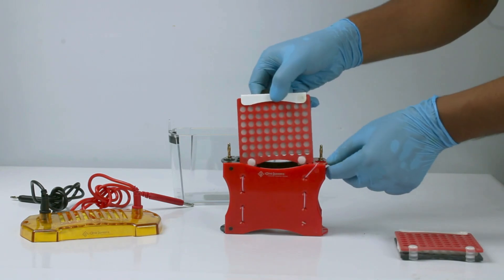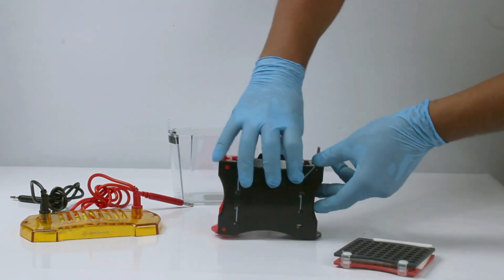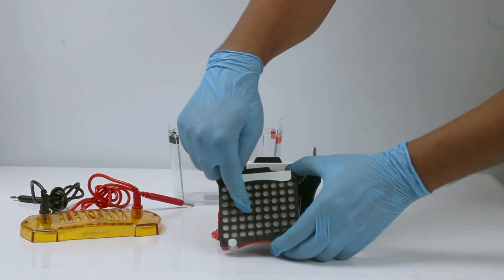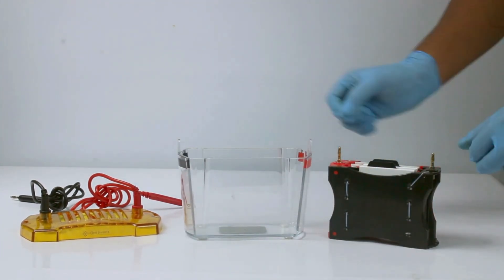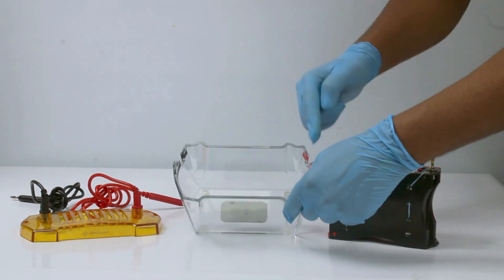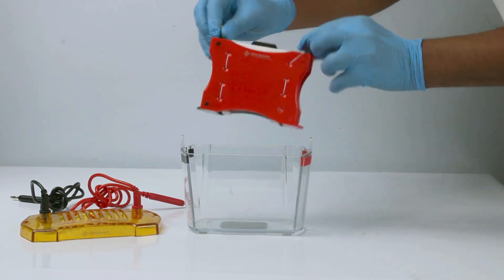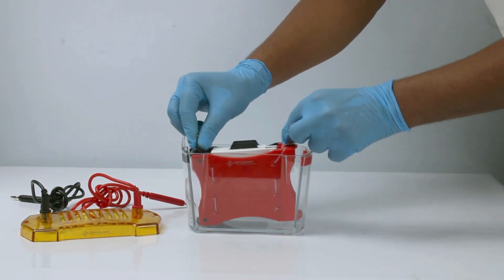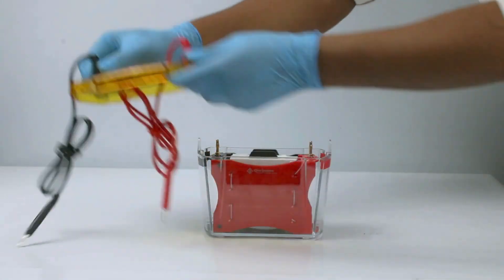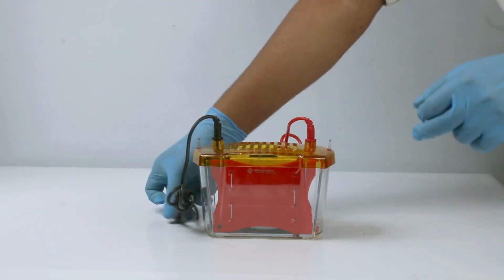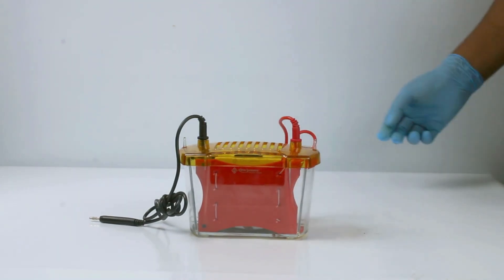Place the transfer clip into the transfer blot module, ensuring that the red side of the clip aligns with the red side of the module. When the whole transfer blot assembly is completed, take the buffer tank and place the transfer module inside the buffer tank, aligning red for positive and black for negative. Connect it with the power supply to start the transfer.